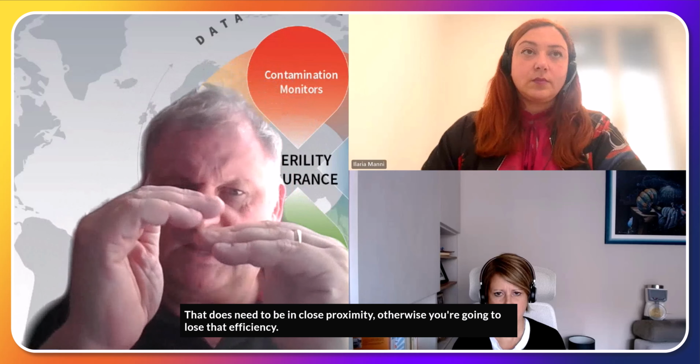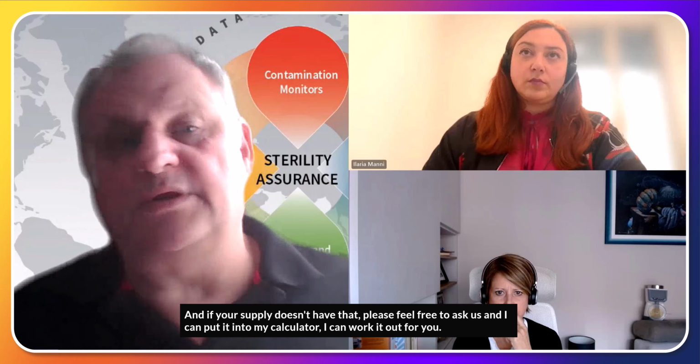That does need to be in close proximity, otherwise you're going to lose that efficiency. So it depends, but data should be available as to what the width to height to S1 versus S2 looks like for any impactor. And if your supplier doesn't have that, please feel free to ask us, and I can put it into my calculator. I can work it out for you.